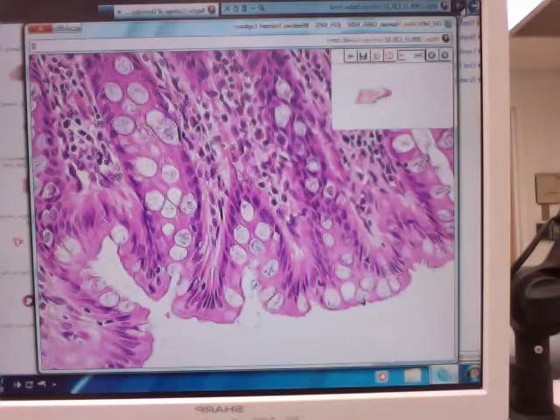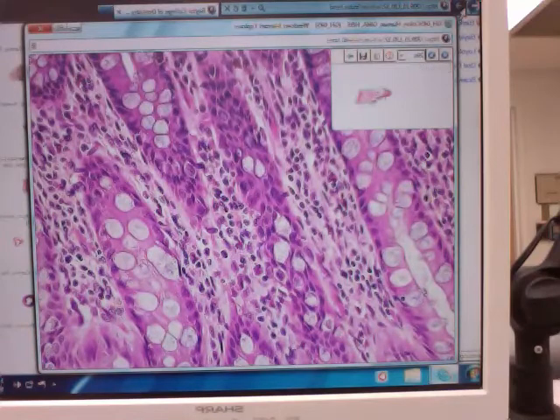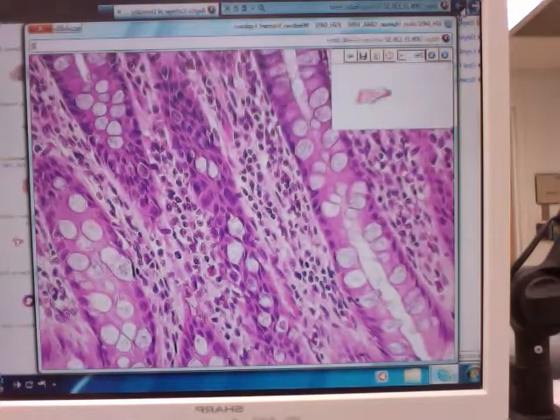Okay, and then all this is connective tissue, lamina propria. Oh, sorry, just connective tissue, loose connective tissue. Sorry, getting ahead of myself here, teaching you stuff you don't have to know. But you can see all the different cell types. You see a lot of these cells with these red granules inside of them. You'll learn what those are soon enough. Lots and lots of those.